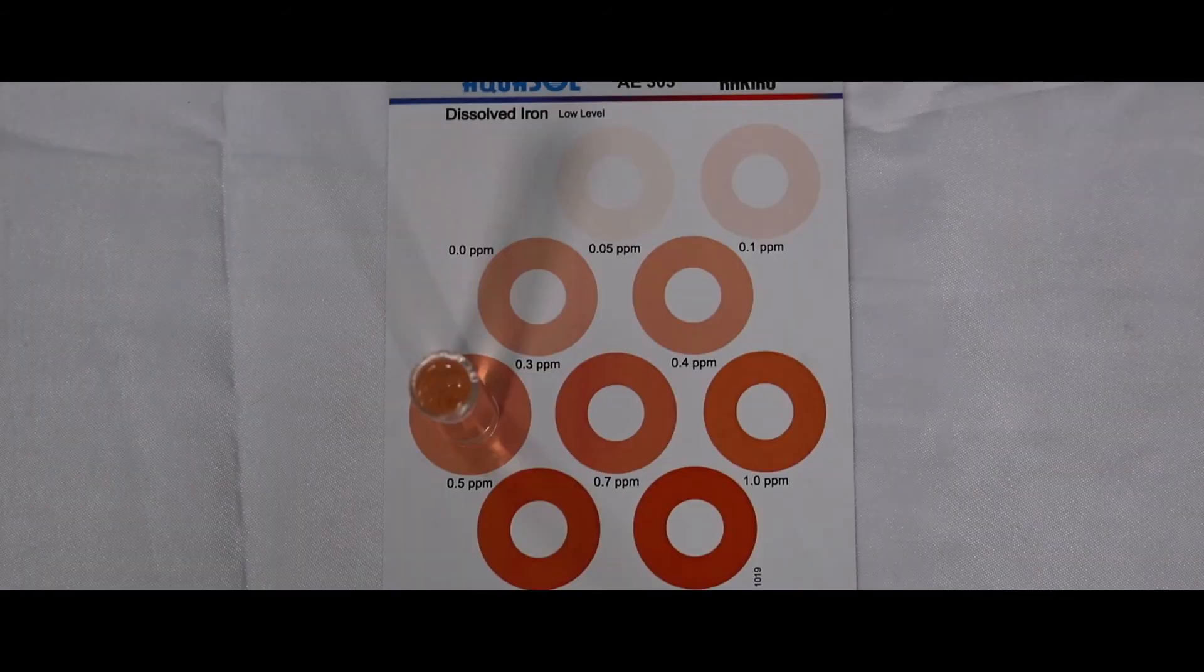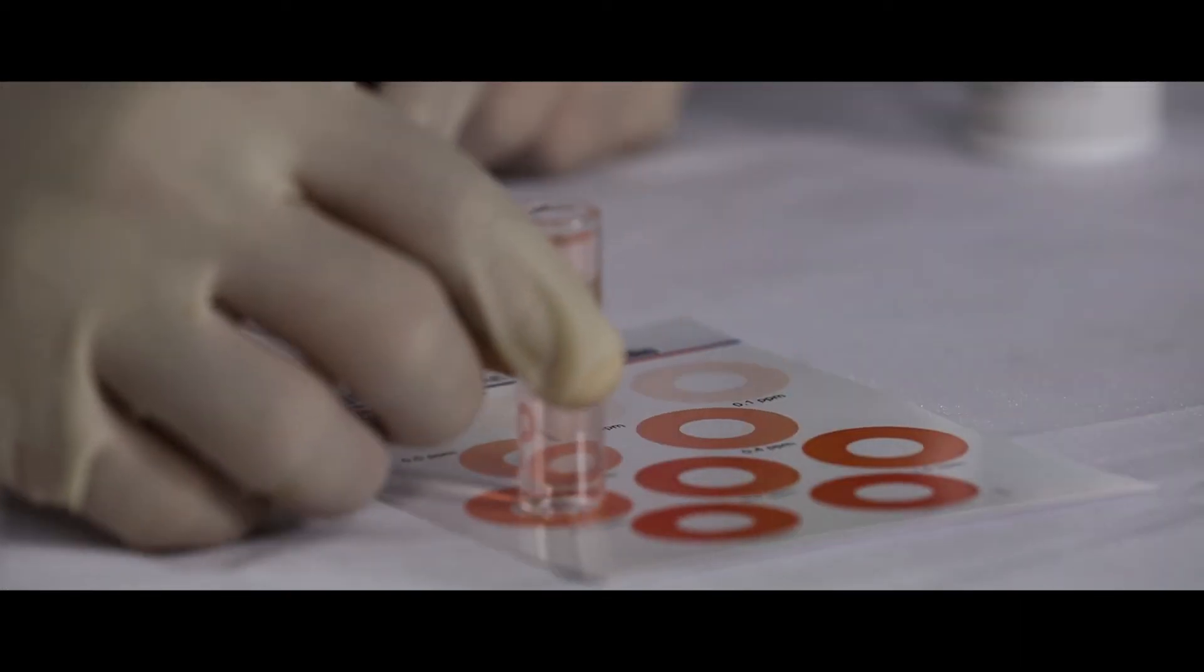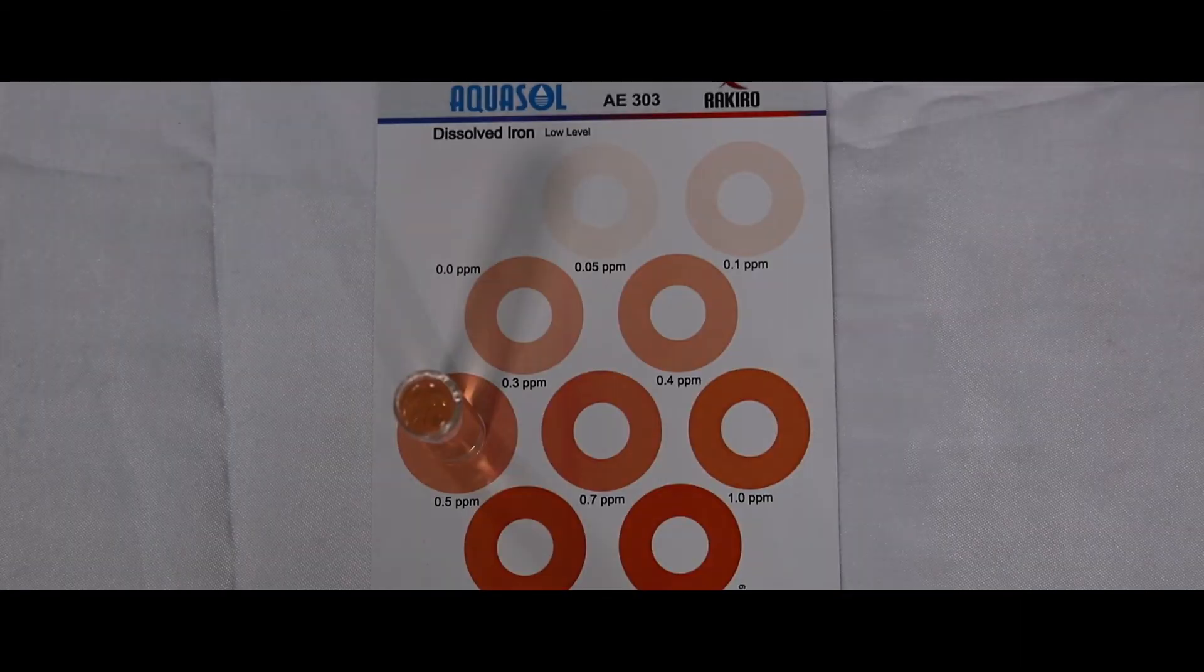Make sure you are viewing from top of the tube. Matching color indicates the value of your sample.